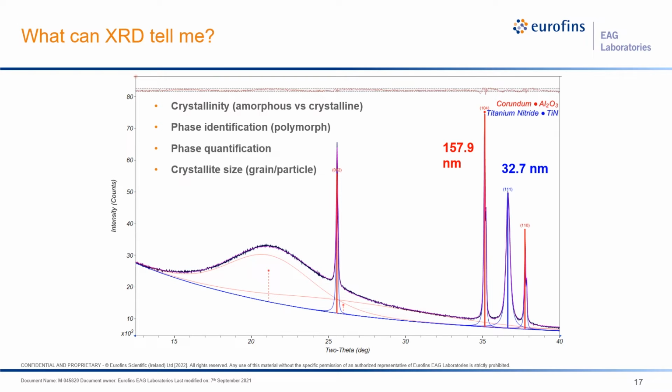Next, we take a closer look at the width of these diffraction peaks. By examining how broad or how narrow a diffraction peak is, we can determine the average grain size of that particular phase. This technique may be used for studying differences in grain size due to growth or solidification processes. It can even tell if you have equiaxed grains or if they are more elongated.